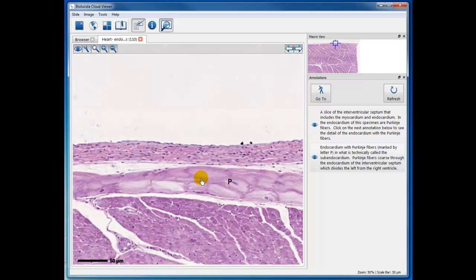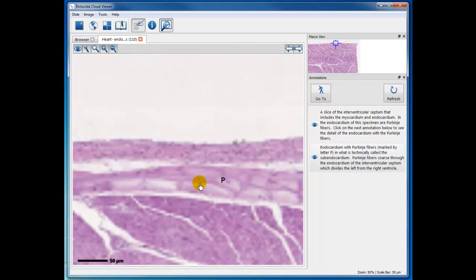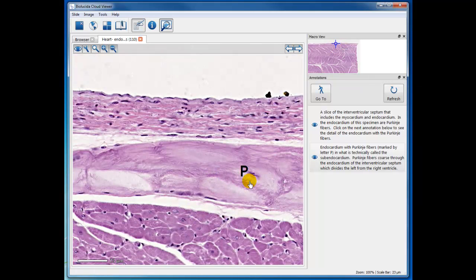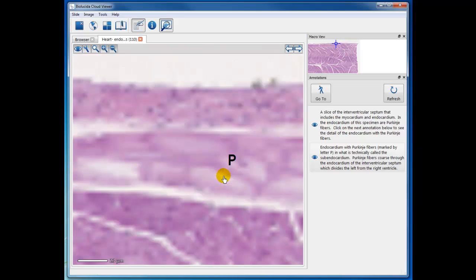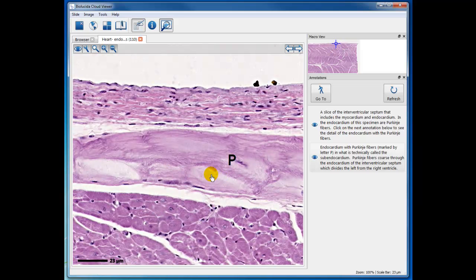But these are the Purkinje fibers, where they're rather hollow and they have a rim of myofibrils that are very similar to the myofibrils in the rest of the heart, in the cardiomyocytes. But this just illustrates the hollow area, which is composed mostly of glycogen. So you take this image and others that you see in the lecture and in the lab to try to bring up the whole story. So that ends this about the heart.